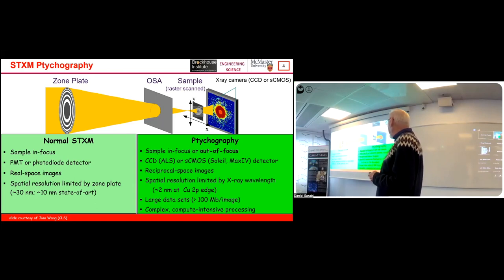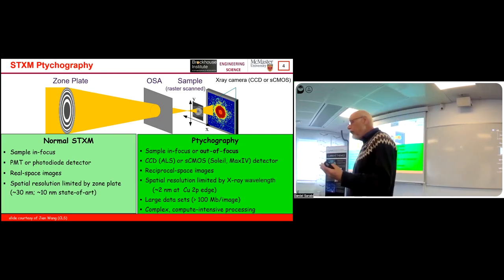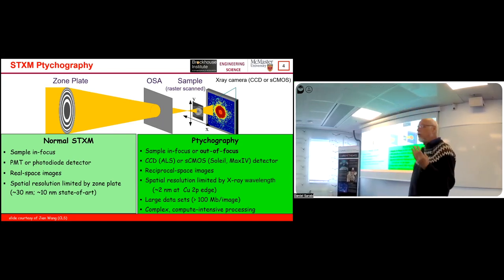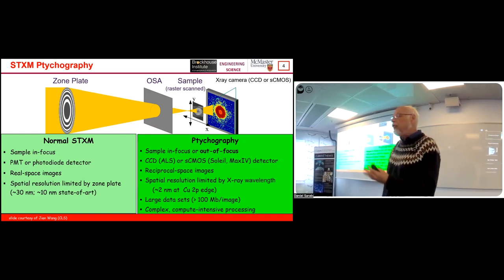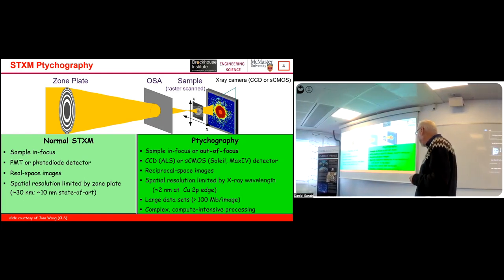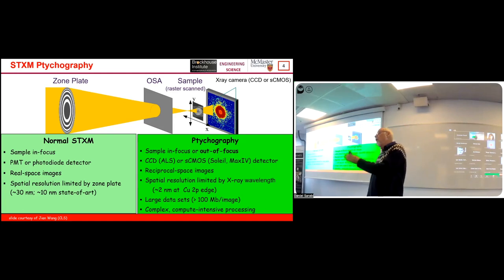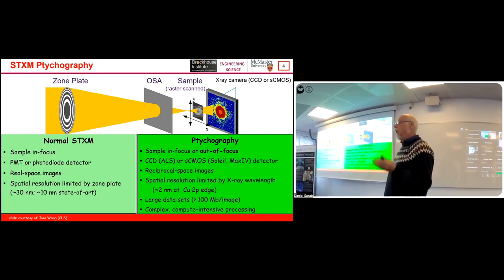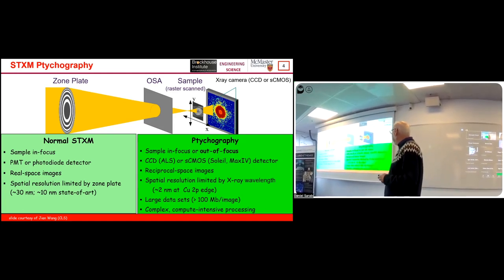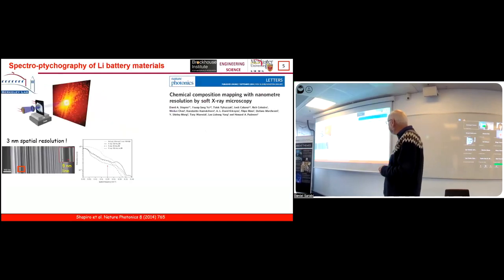And the advantage now is that we have a platform that's designed for imaging. A lot of work has been invested over the years in STXM to use interferometry to get very accurate positioning and accurate reading of the positions of your probe relative to points on the sample. And all of these factors mean that it's a relatively simple transition from doing single point detection of transmission signals to the whole ptychographic experiment, by taking advantage of all the effort that's been put into making STXMs.